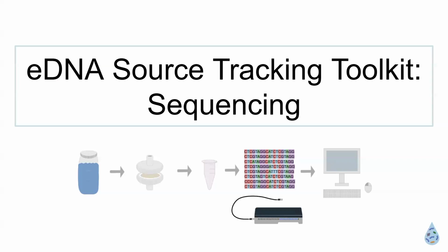How would that process change if you were doing the sediments? If you were doing a sediment sample, again, sterile collection, freeze it immediately. You could also use liquid nitrogen or dry ice to freeze your sediment immediately, because it's worse than water. And then you wouldn't filter it, you just take it directly to extraction after you freeze it.